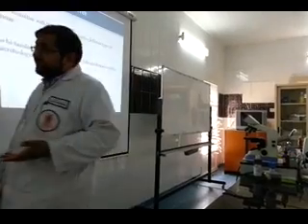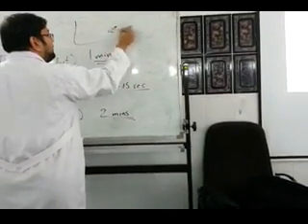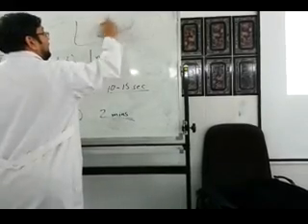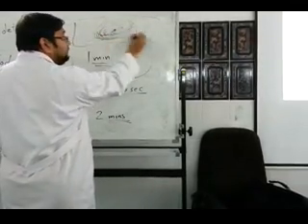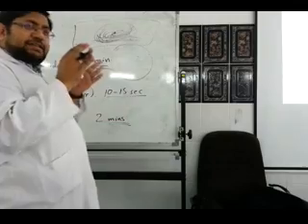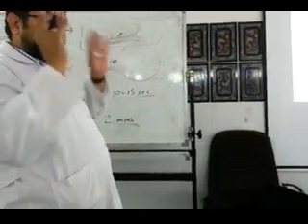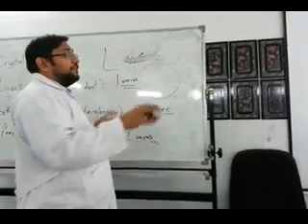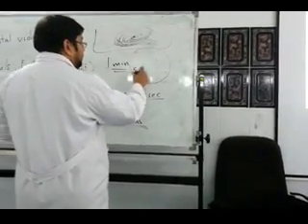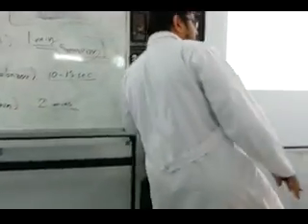If you take a slide like this, you put a drop or some amount of bacteria and you spread it. Make it big like this. When you spread it, you are spreading bacteria. If you make a thick smear, you have multiple layers of bacteria. If you color the top, the bottom will not color. You will have difficulty identifying. So there is a process of making a smear. For every type of staining, you first have to make what? A smear. If you make a good smear, you make a good stain.